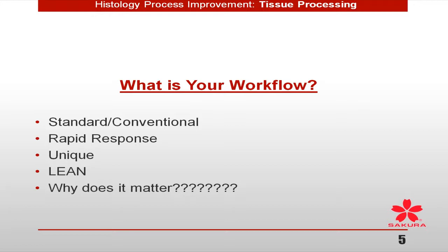You have to be more patient-centric. You know, loading up your processor overnight, or whether you're using a microwave processor or a rapid processor, we have made decisions to use those, but did we really start our process of selection with why this is in the best interest of the patient?